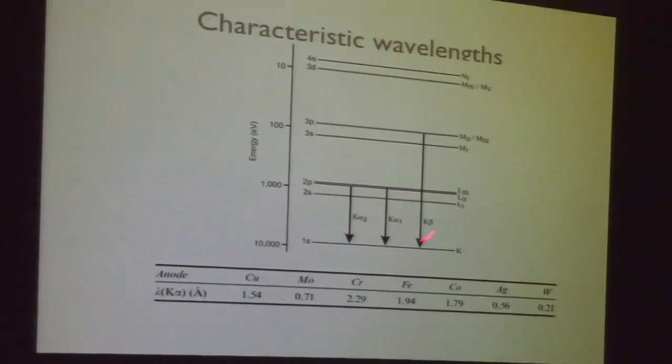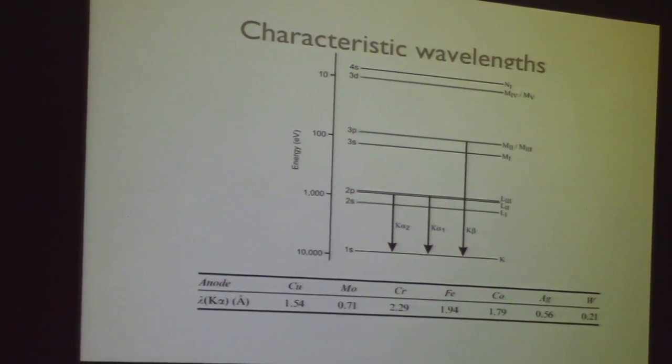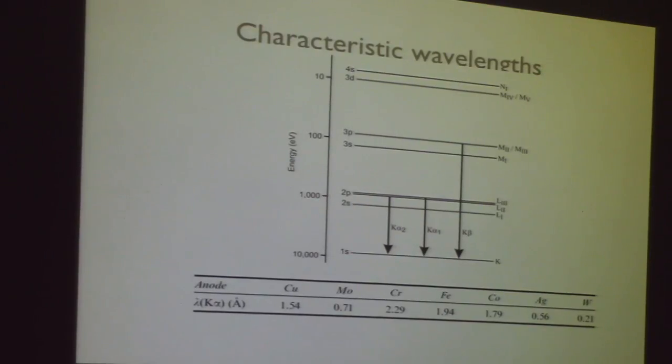This is why you get more than one characteristic line. The accelerating voltages that we're using are appropriate for exciting the K band of the X-rays, which is coming from the very lowest energy level. So it's the 1s state of these metals. So we've got electrons in here, the electron comes in, it knocks this electron all the way out, it leaves a hole here, and then there are all of these different possibilities for electrons in higher levels to fall down and fill that hole.